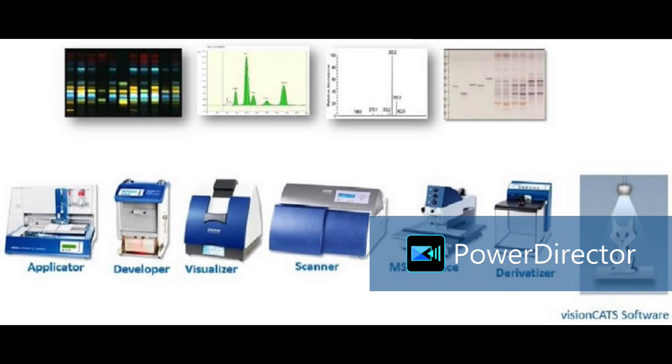So if we visualize the plate only under 254 and say that only one component is UV active detected, no. Take the plate, do multi-wavelength scanning, कोई ना कोई wavelength में वो वहाँ जो अगर बैंड होगा तो it will absorb and show you the peak response.